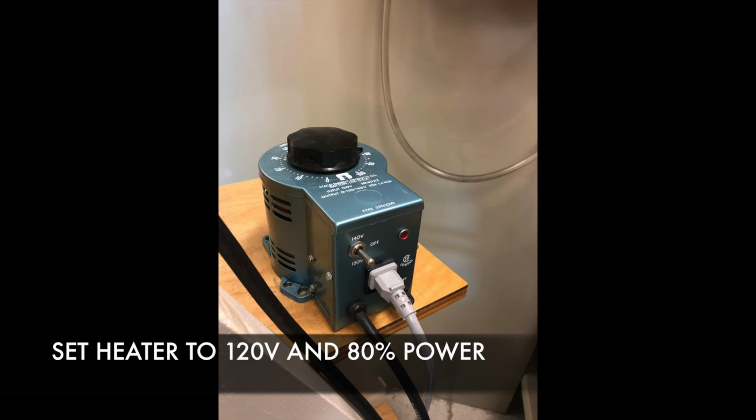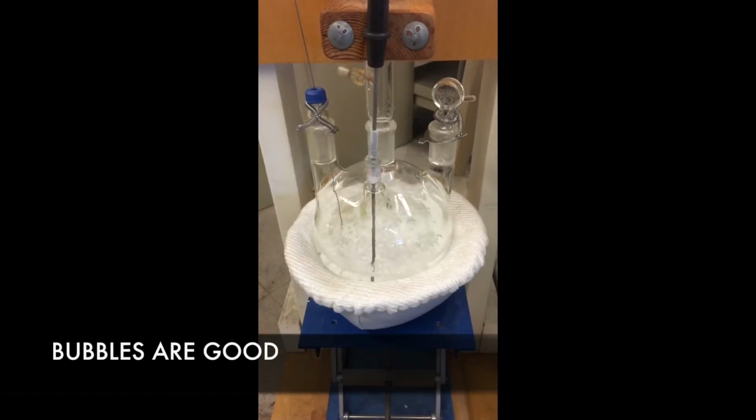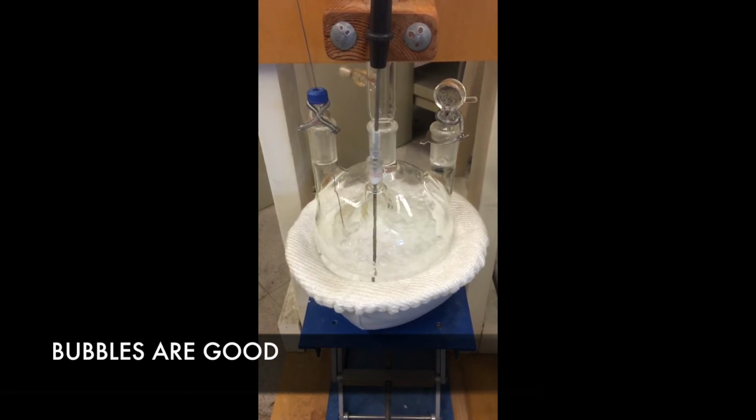Once the heat has been on long enough, you will begin to see the temperature increase on the thermocouple. Watch temperature closely, because if it goes past 85 degrees and there is no formation of bubbles in the boiler pot, immediately notify your TA, as this can lead to superheating and cause the glass to break. You definitely don't want this happening. As you can see here, we had no problems with this, as we got bubbles.